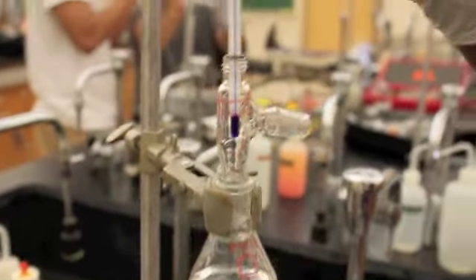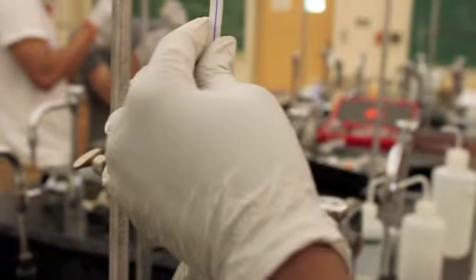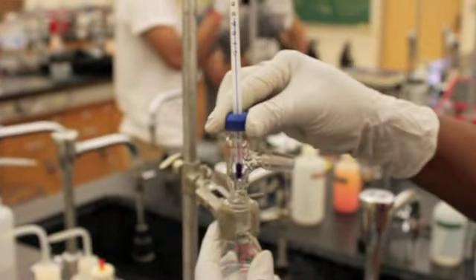Now, this is very important because when the reflux starts, that's how you'll monitor the temperature. It's very important to make sure that your thermometer is just below the sidearm. Then take the cap and insert it, the cap on the thermometer, because when the vapors come up, you want the temperature of your vapors on the thermometer, and ensure that it's tightly closed.